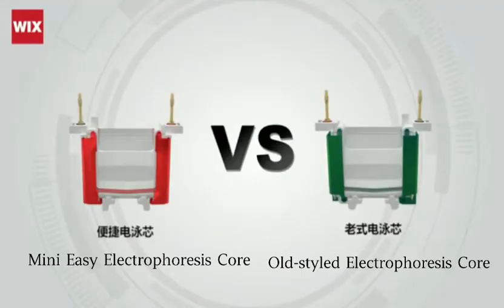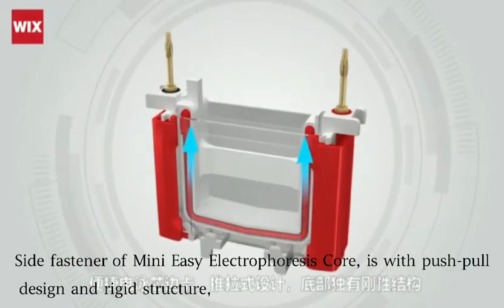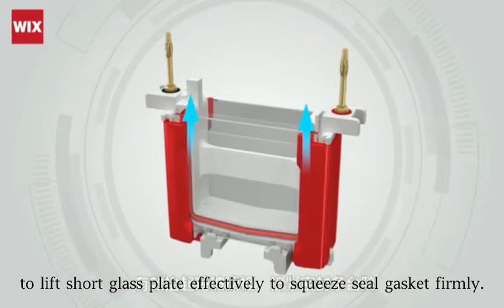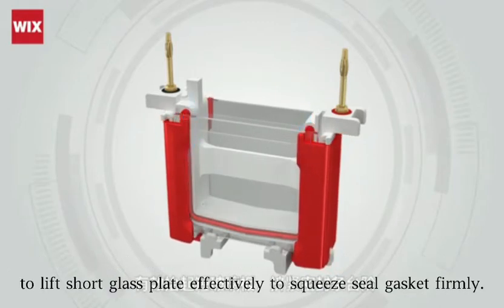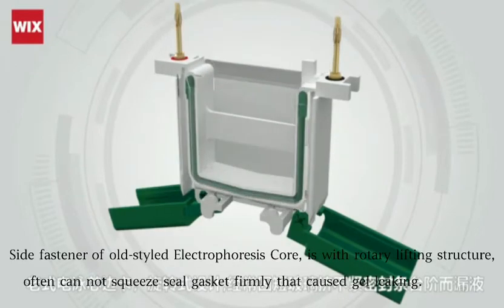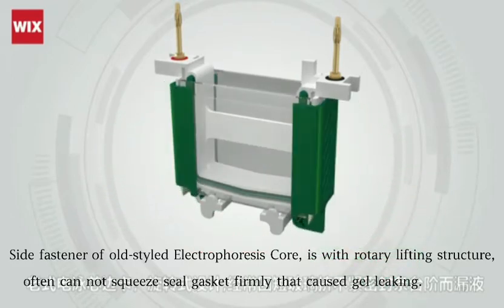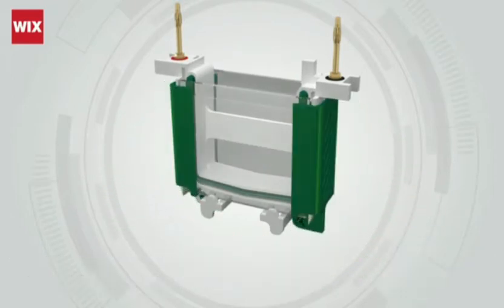The easy electrophoresis core versus the old-style electrophoresis core. The side fastener of the easy electrophoresis core uses a push-pull design with a rigid structure to effectively lift the short glass plate and squeeze the seal gasket. The set fastener of the old-style electrophoresis core uses a rotary design that often cannot squeeze the seal gasket firmly, causing gel leak.